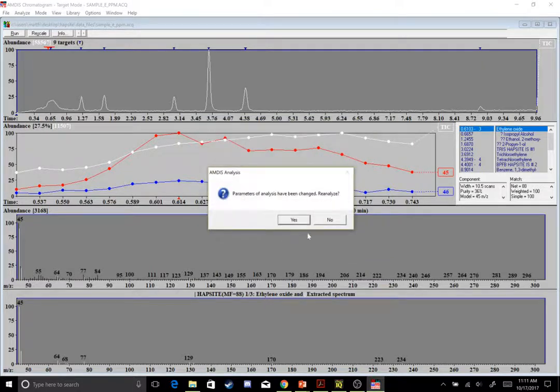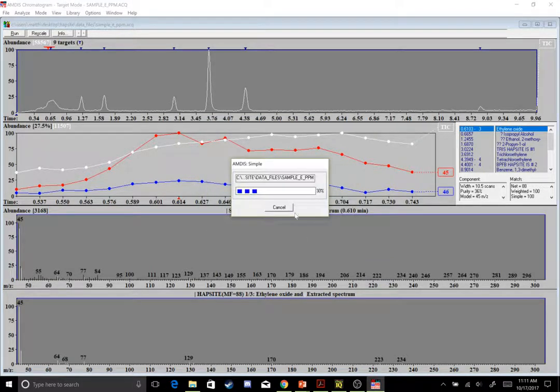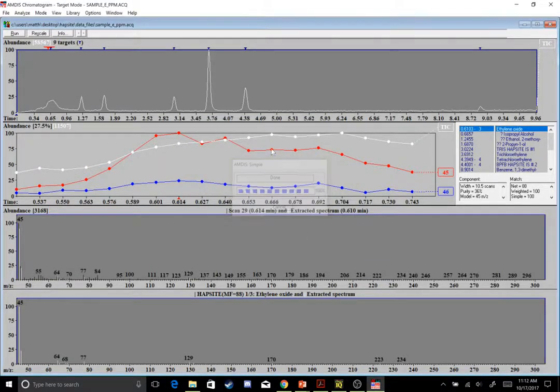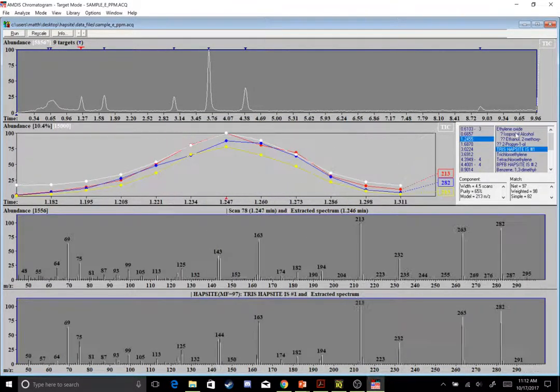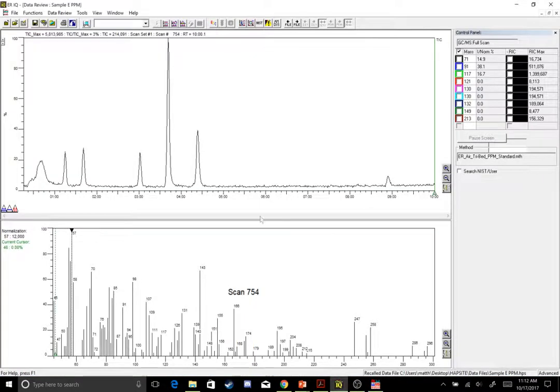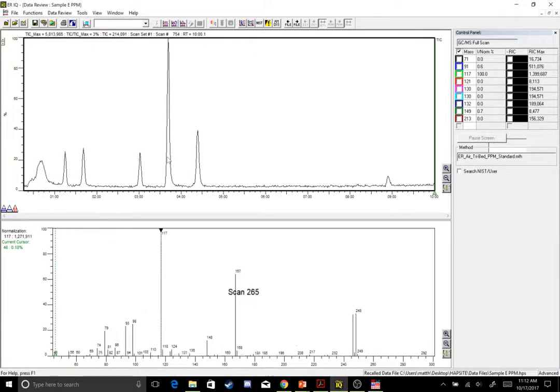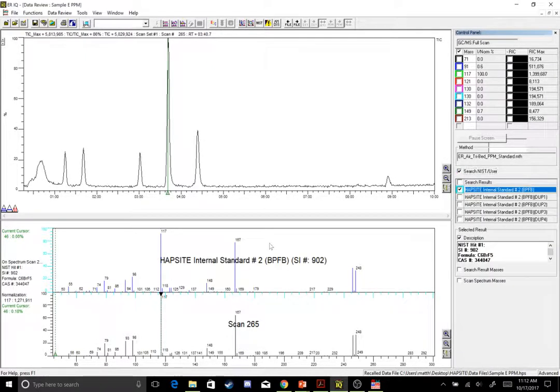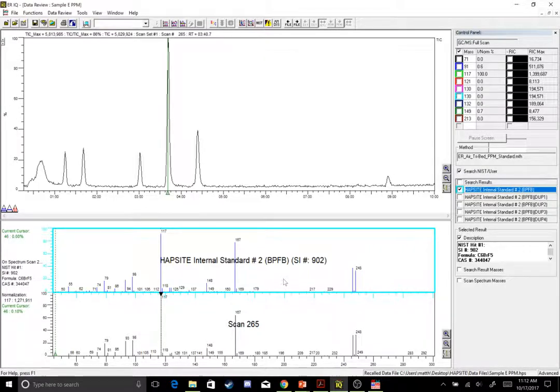That should be all. And now whenever you try and run your NIST report or your AMDIS report, you'll have something like this for AMDIS. Let's go back into our ERIQ. And now if I select a peak, I can select search NIST slash user, and then it generates a hit right here. Thank you.